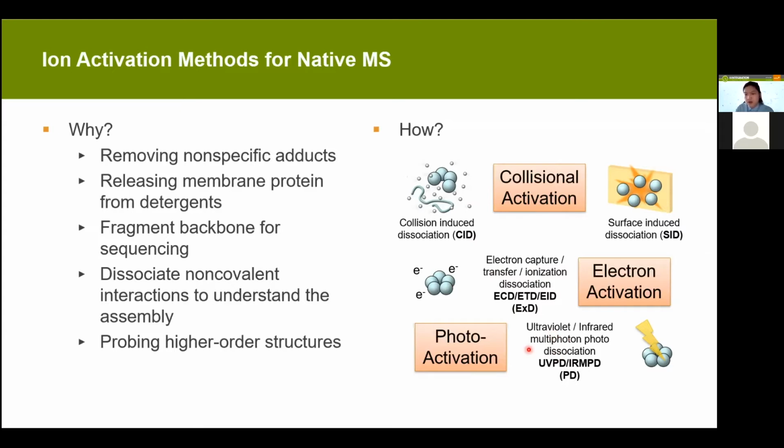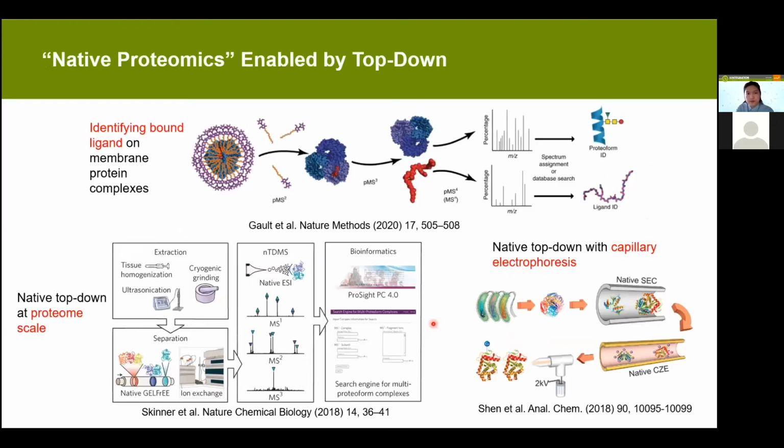And as I was saying, a lot of those techniques, except CID, are not as widely commercially available. So you typically need specialized instruments and operation. But things are changing fast because the companies are making a lot of effort to make this easier to use and commercialize, so everyone can start to use this to study protein structure.